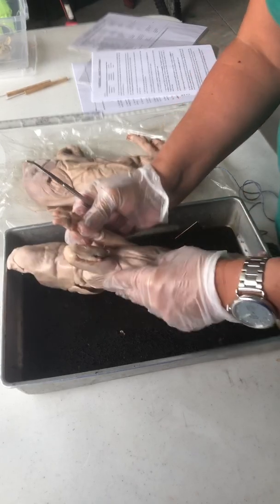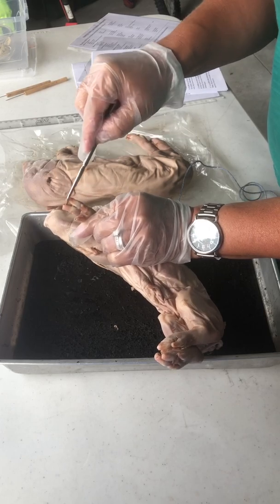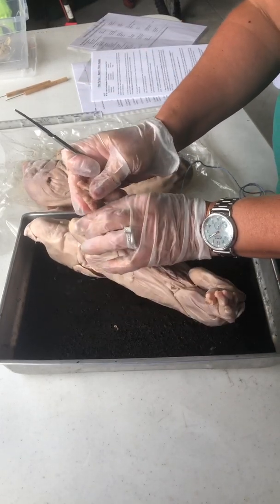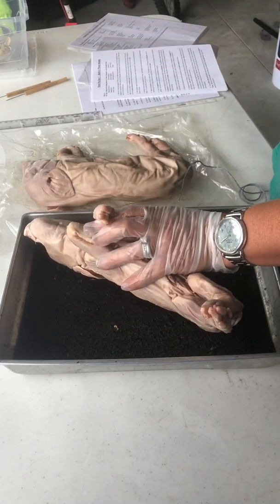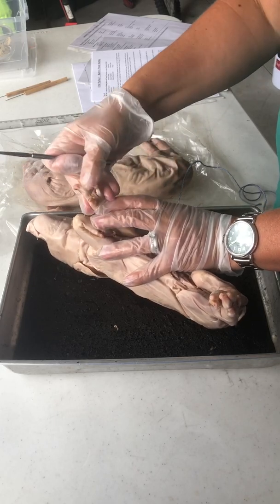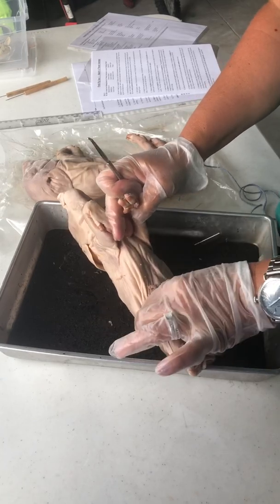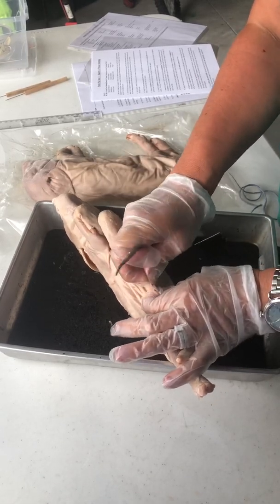So here we're looking at the toes. And if you look at this, you can see that it has four toes here. It does not have a solid hoof like a horse. It is cloven, divided hoof. Next, we're going to locate the umbilical cord. So right here is the umbilical cord.